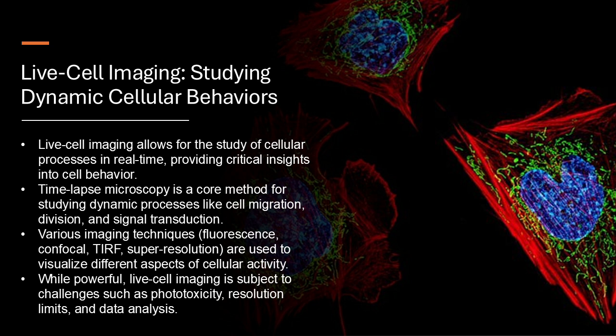Researchers have to carefully control the intensity and duration of light exposure to minimize any potential harm to the cells. So how do they manage that? What are some of the strategies they use?